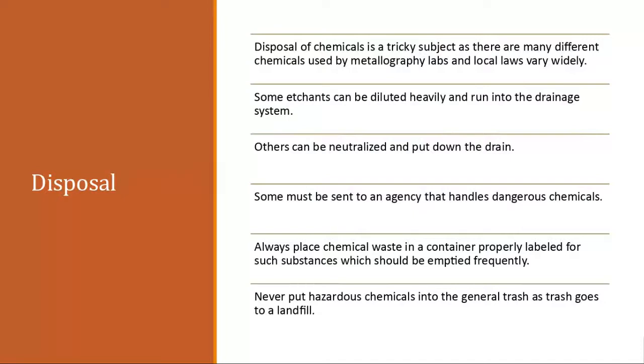The only disposal you'll need to do in the lab is whatever you use to etch your sample. We're not asking you to carry out the waste bucket that has 5 liters of basic waste or acidic waste. That's where we call EH&S. They come in and they handle that properly.